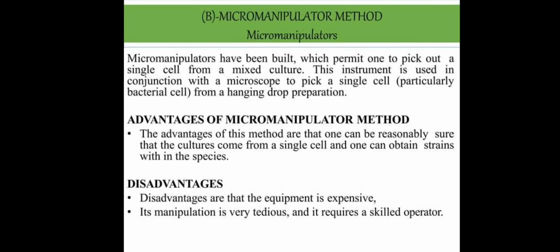Micromanipulator method. Micromanipulators have been developed which permit one to pick out a single cell from a mixed culture. This instrument is used in conjunction with a microscope to pick single cells, particularly bacterial cells, from a hanging drop preparation.